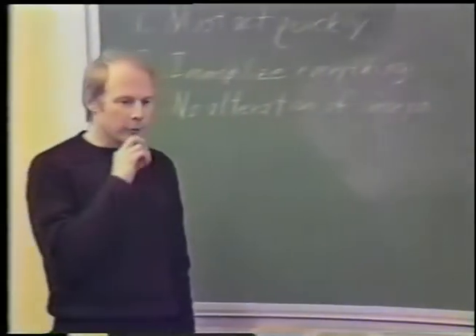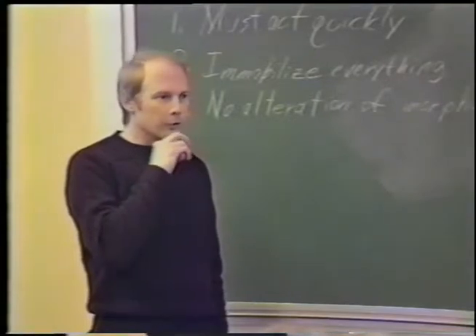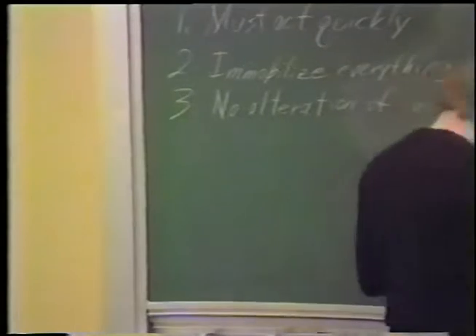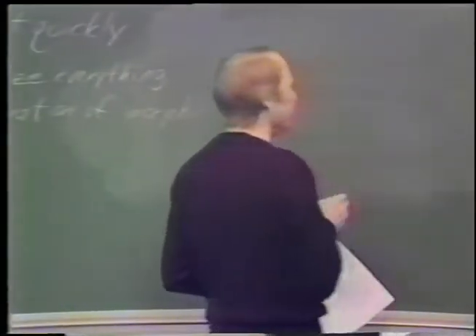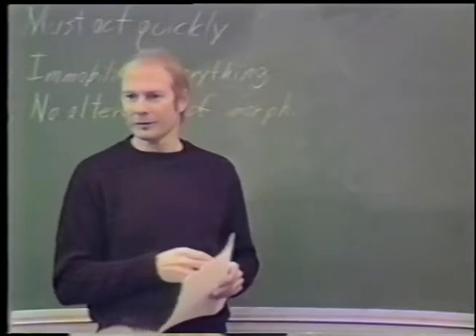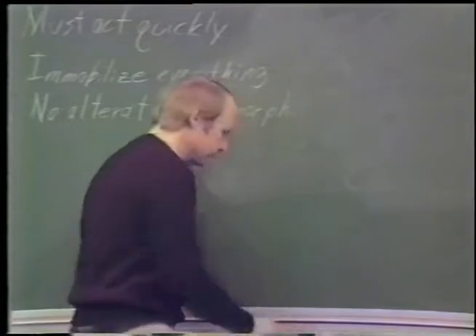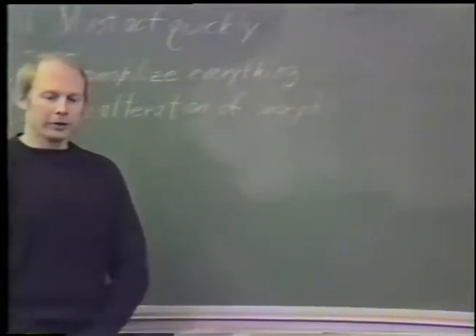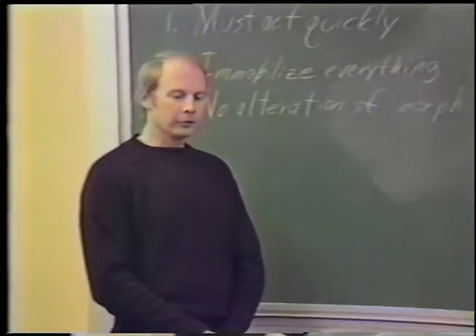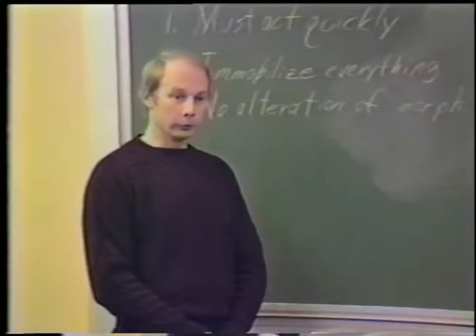Now, ice crystal formation in ultra-rapidly frozen cells can be described in terms used in classical nucleation theory. Are you all familiar with the flickering cluster model of water? Water is not homogeneous. At any given instant, if you were to look at the structure of water, you would find some regions, most regions not ordered.